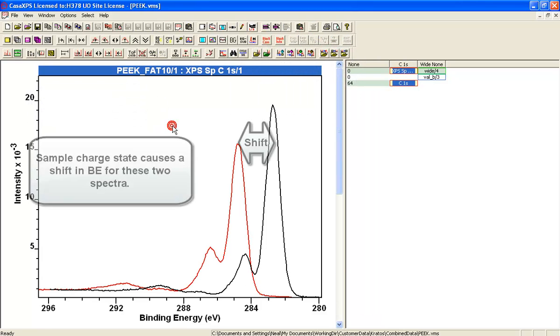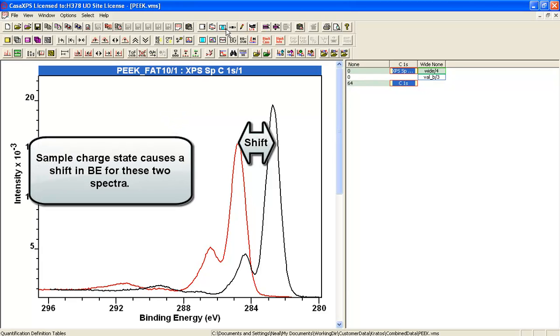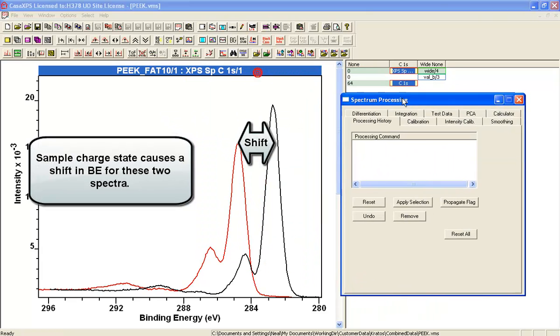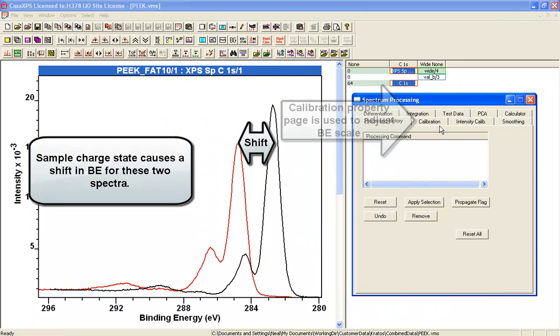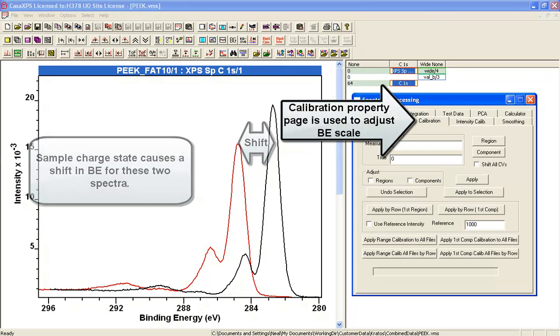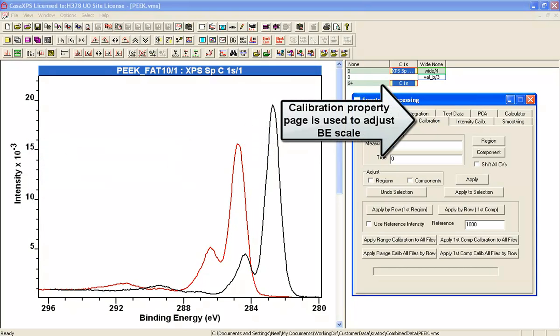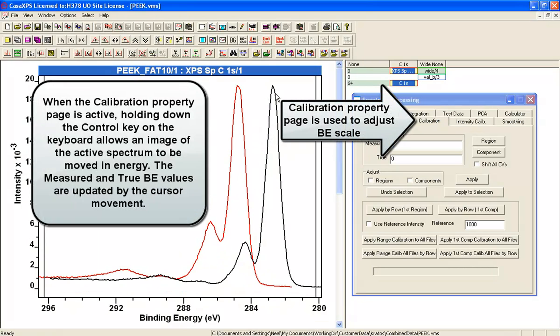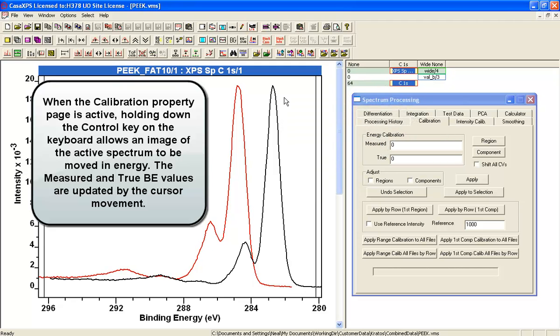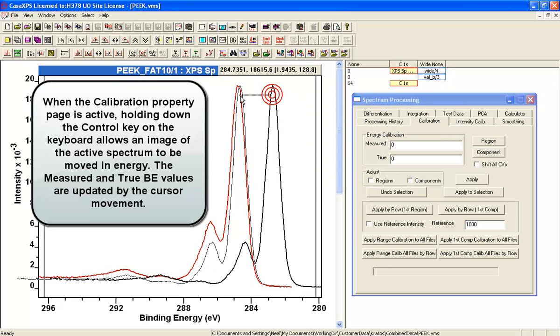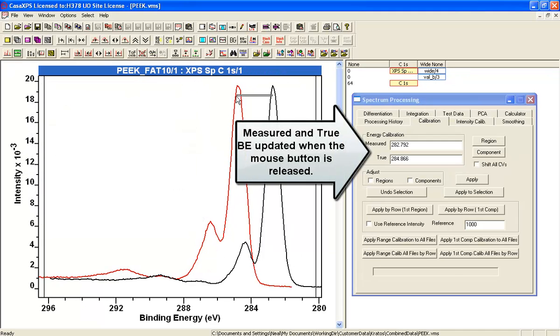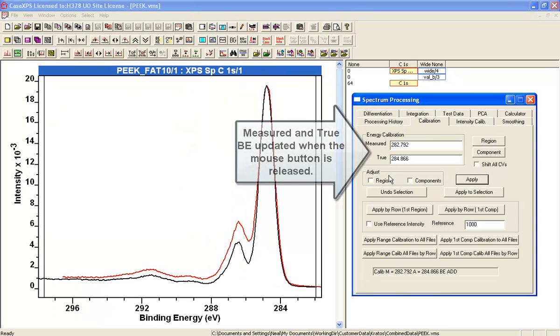Now there's an offset here so what I'm going to do is use the calibration property page and I think I'll normalize these so I can see the data clearly. And then I'm going to hold the CTRL key down and move the peak and then press apply.